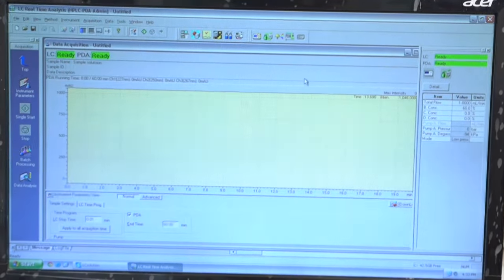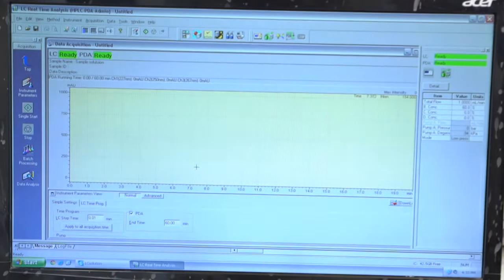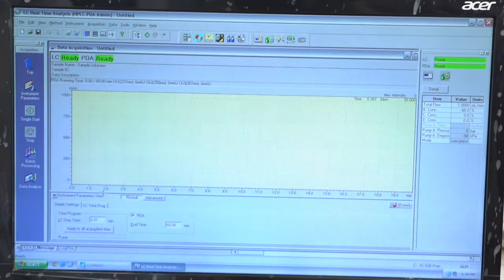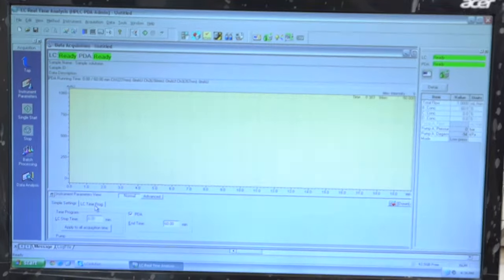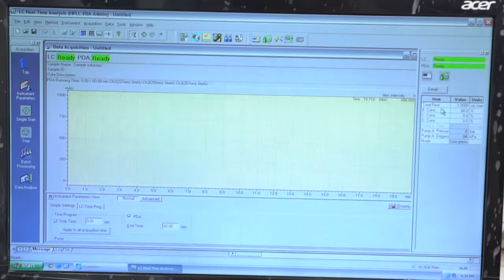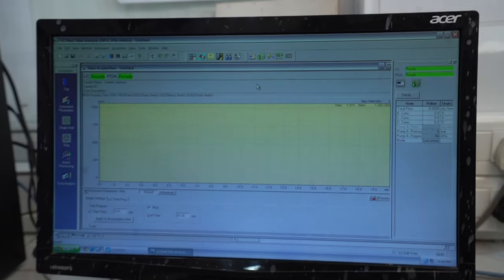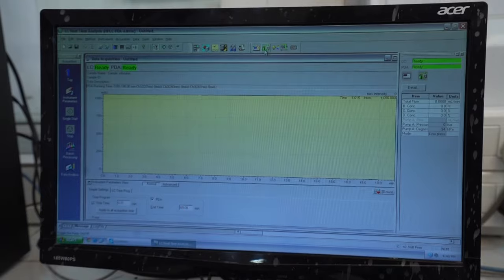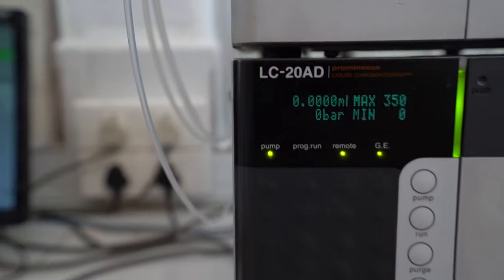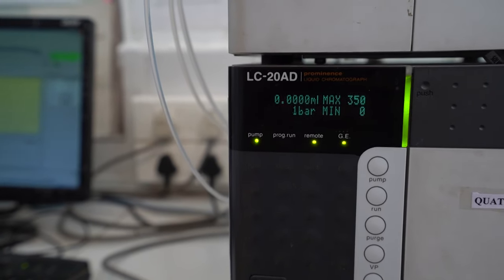This is the real-time analysis window, which has a data acquisition area where the real-time analysis can be viewed. We have an assistant bar where commands can be given, an instrument parameter view where method analysis details can be input, and an instrument monitor where temporary changes in mobile phase flow rate and solvent concentration can be given. We will operate our system through the software.